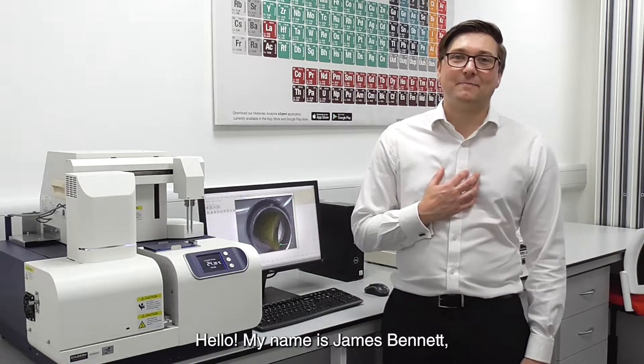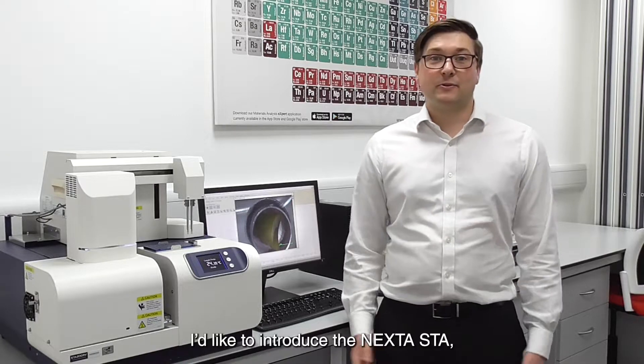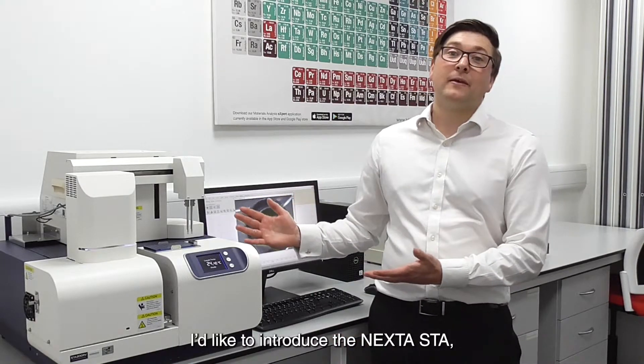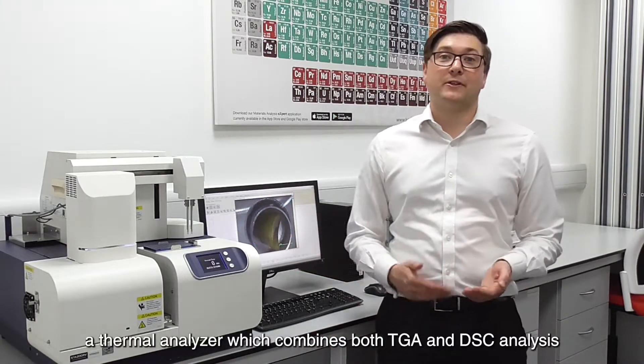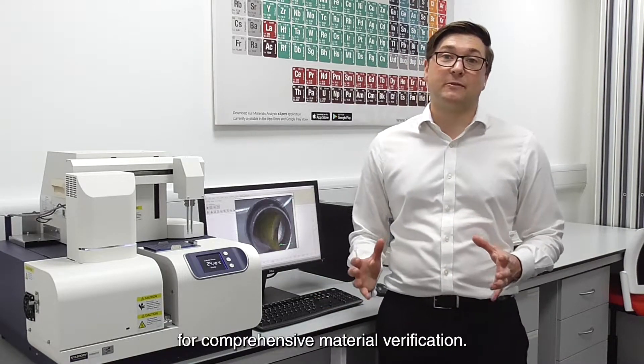Hello, my name is James Bennett and I'm one of the thermal analysis experts at Hitachi. I'd like to introduce the NEXTA STA, a thermal analyzer which combines both TGA and DSC analysis for comprehensive material verification.